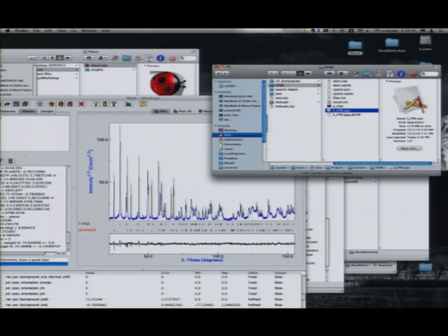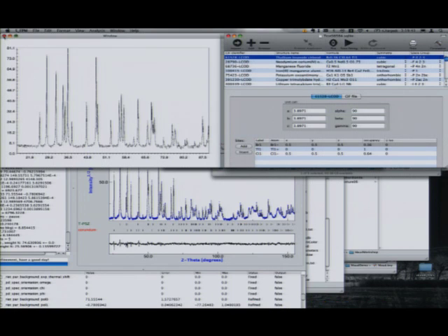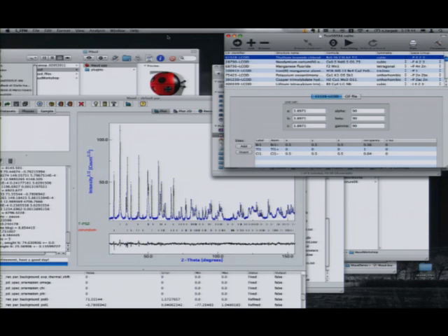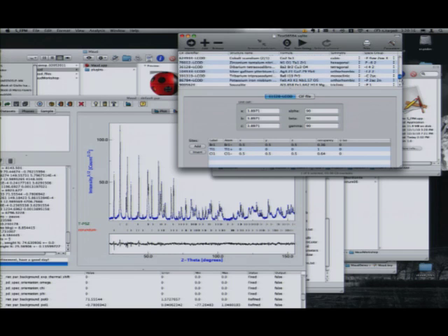I want to show one thing. What I was occupied with last year, when I didn't work on MAUD, is this program here. Actually, it worked on Mac with an interface, and on Windows without. So I loaded the database that I constructed from all the CIFs coming from the code and from all the CIFs I found around my disk. So I have here nearly 100,000 phases. I can scroll through. You can see I have all of them.